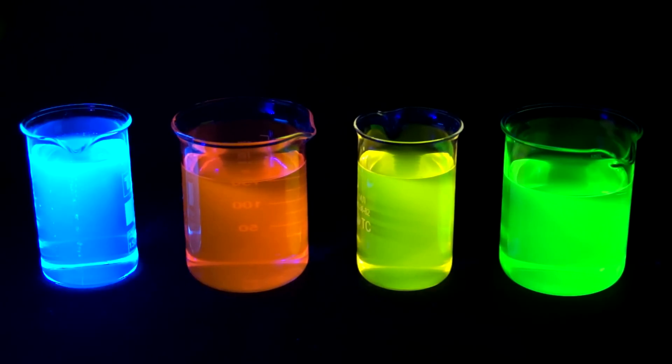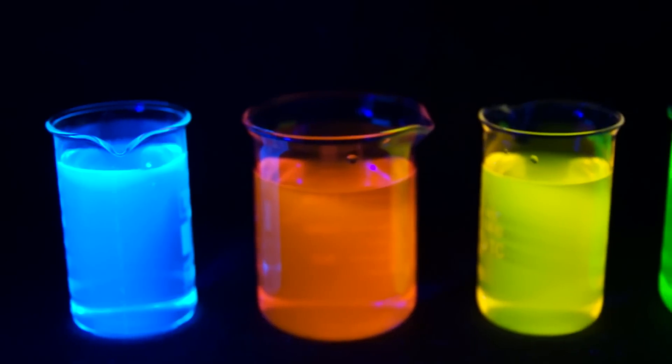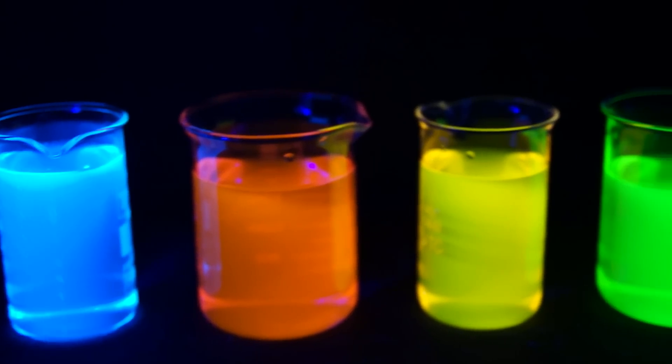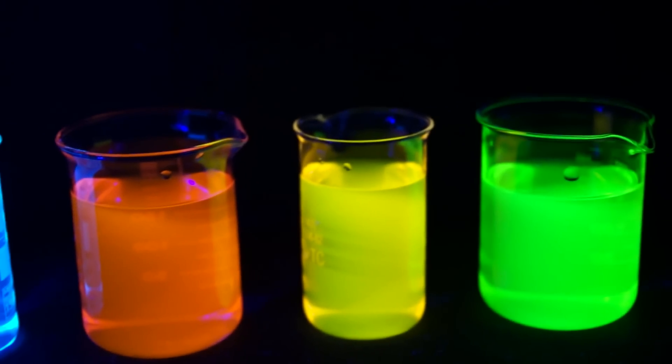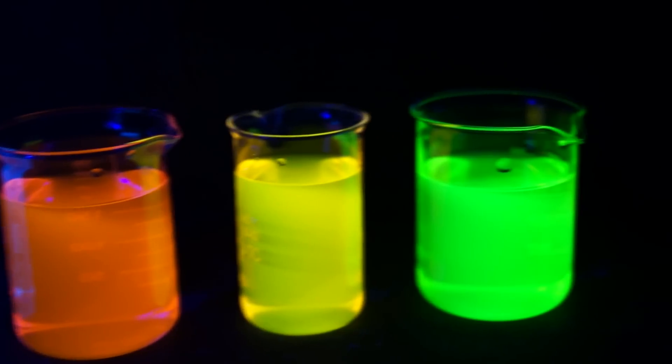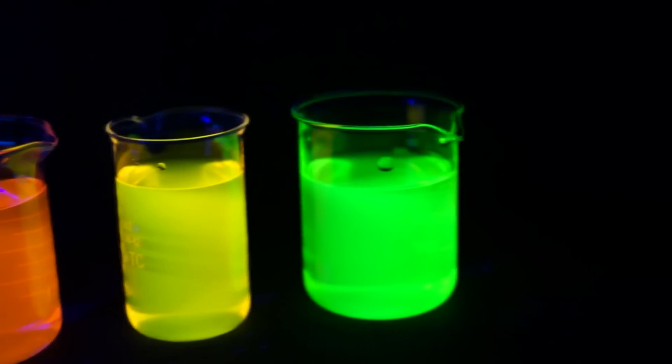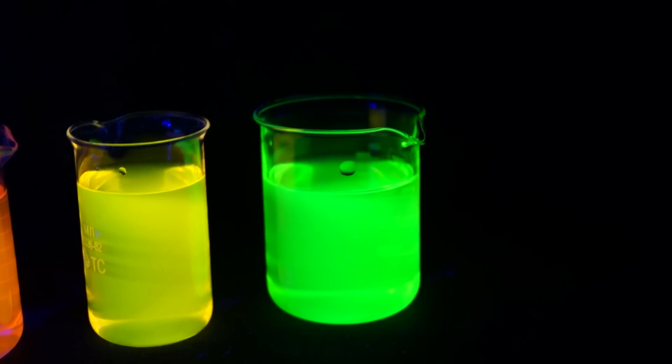In ultraviolet rays the solutions look much more interesting. Schweppes glows blue, Rhodamine-B glows orange, Rhodamine-6G glows yellow, and the Fluorescein solution glows bright green.